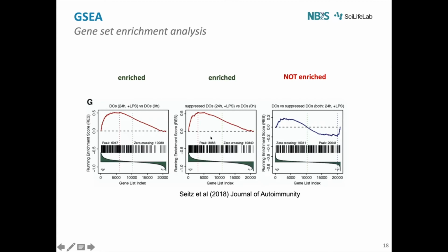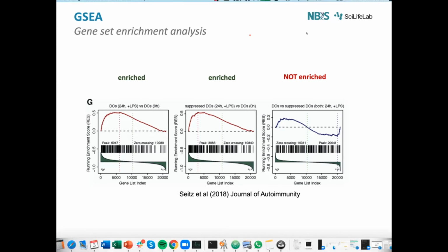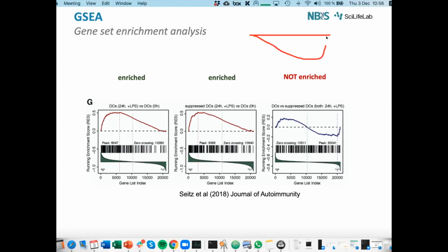Likewise, if you select a gene set that is downregulated in the first comparison, because here it is always comparing A versus B. So now if B has more than A, then I can annotate here, draw. So then you'll have exactly the opposite, which will be a curve like this. So this will be a downregulated gene pathway. This is up in the first group, and this is down in the first group, or up in the second group. And I can't write down, which is probably wrong. All right.